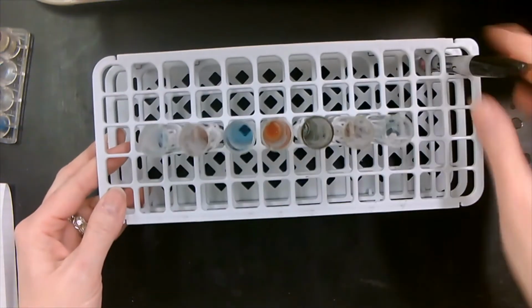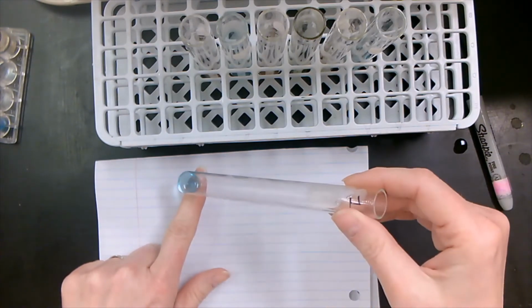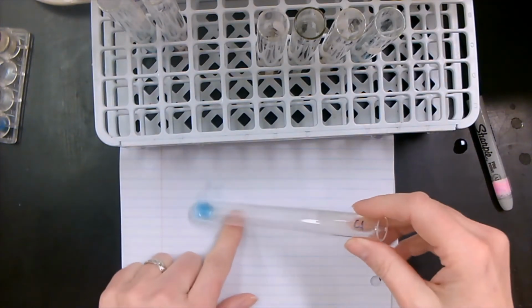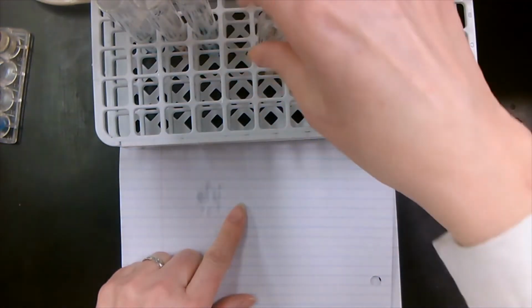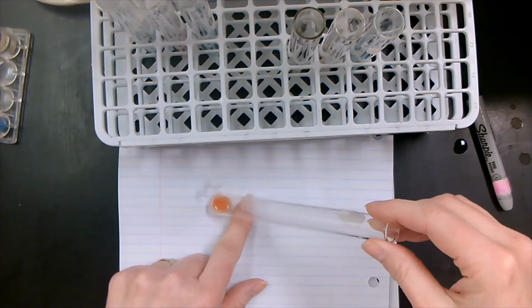Okay, now we've taken our test tubes outside of the water bath. They've changed colors, so let's look at what we got. This is our first test tube. This is our negative control. This is distilled water. You can see it stays blue. This is our glucose test tube. The glucose test tube is our positive control, and it's a brick orange. This test tube has starch in it, and it stays blue. Next test tube is the starch with our hydrochloric acid inside of it, and it turned brick orange.